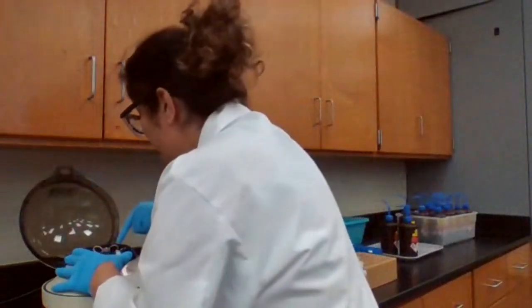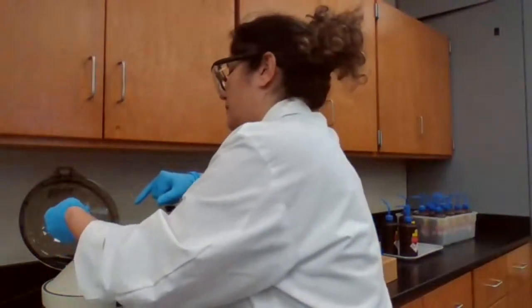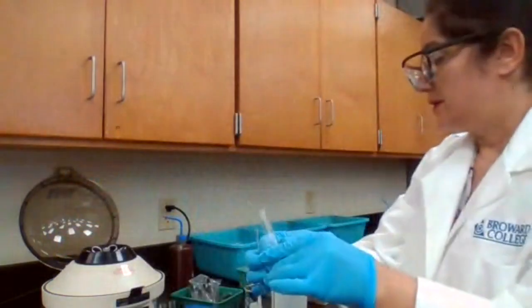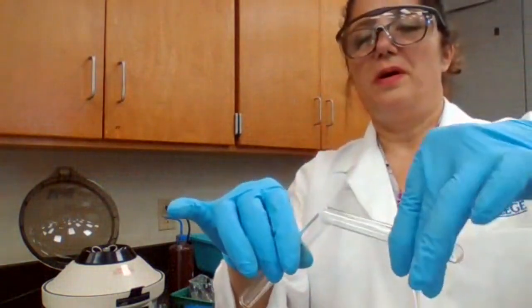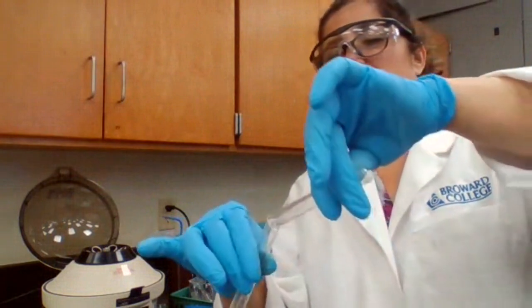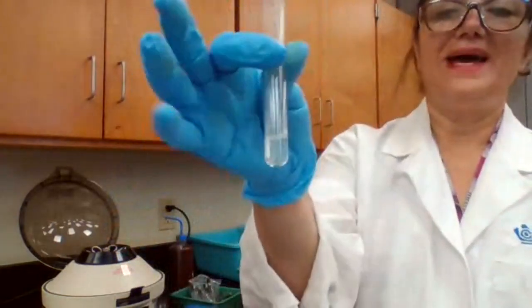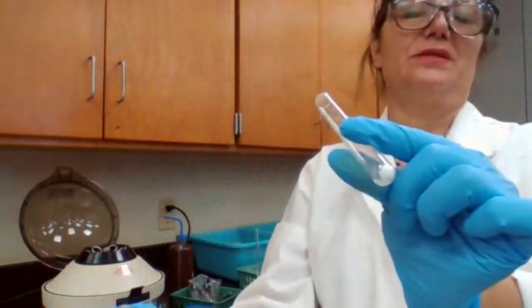Okay. Separate the liquid from solid. Because it's a known solution, I can confidently say that lead should be in the liquid form and silver is in the solid form.